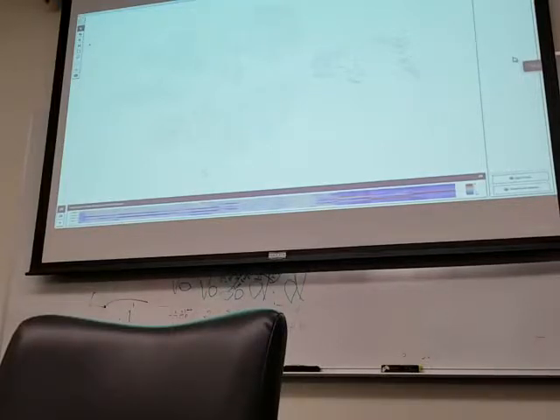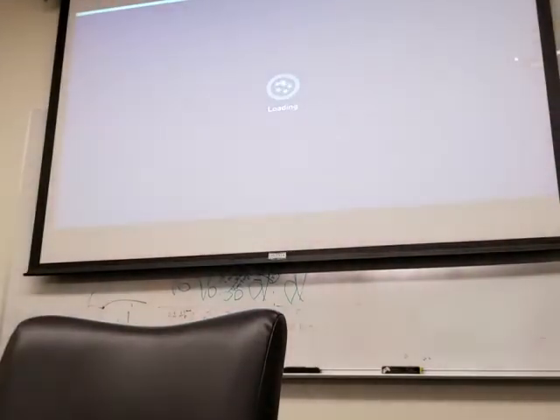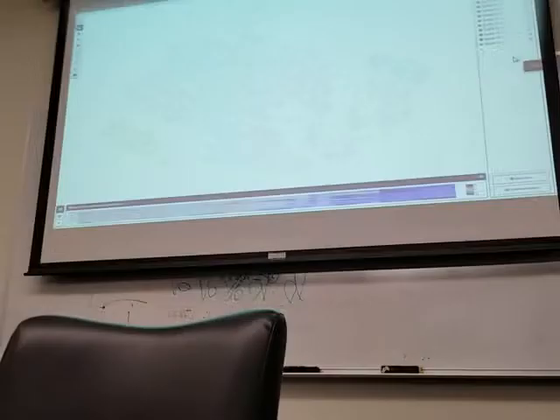I guess for a comparison, we can look at this data real quick. Where was it? Yeah, this one. So just as a comparison, this is Nate's data, but he had 8 different samples, and you can see that they're all spread out a bit, but there's a separation based on treatment groups.